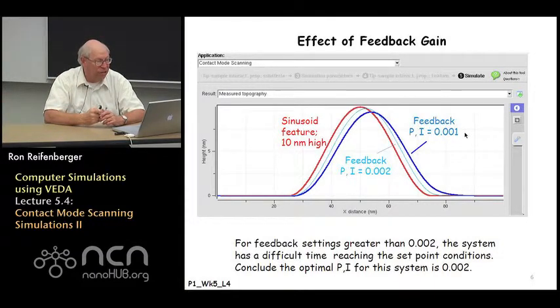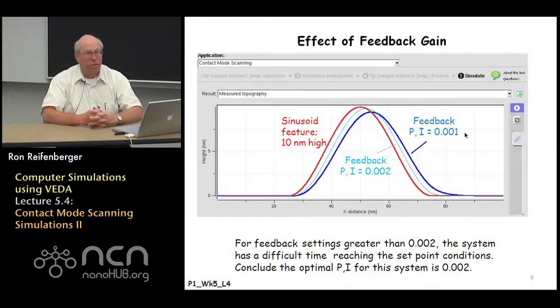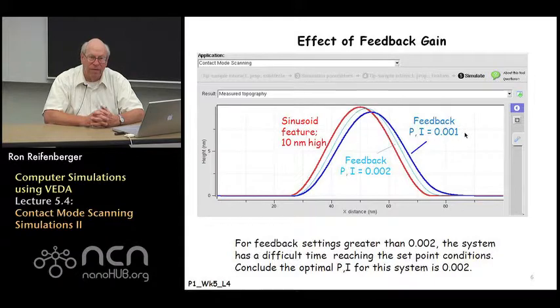The first result here of the simulation is the effect of feedback gain on the fidelity of the tip as it scans over the sinusoidal feature.